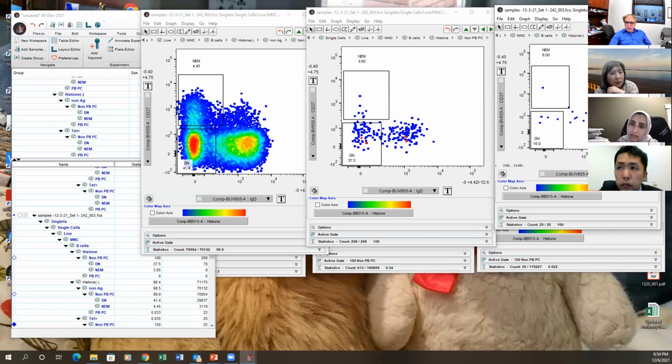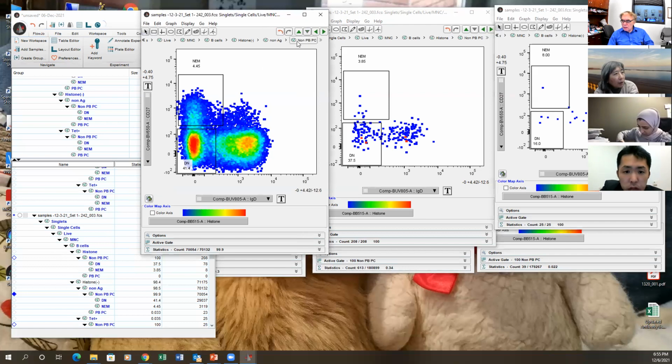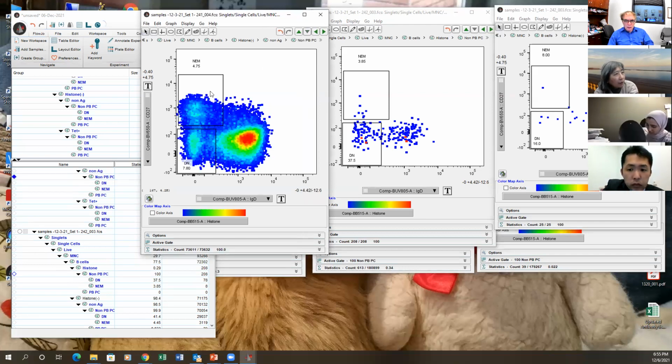And is that everybody? All three are like that, the same pattern that DN has, because this one has a lot of DN. So let me ask you, what are the patients again? This one has 41% DN total. No, what number? Yeah, I see. 242. So this is 242. Right. And what was the other one? 238, 241. All right, 238 is the other one. Now, where's 241? 241 is the sample before this. This is 241.